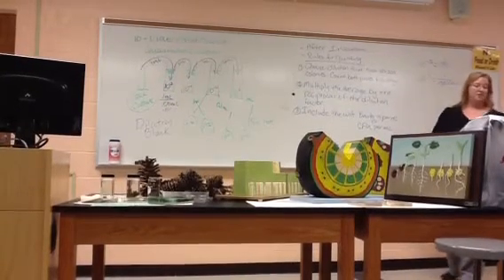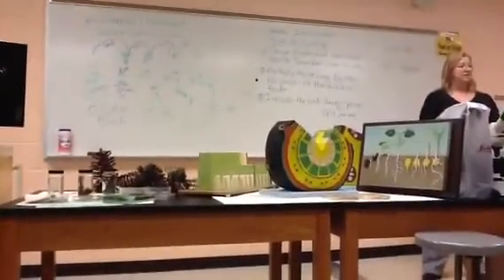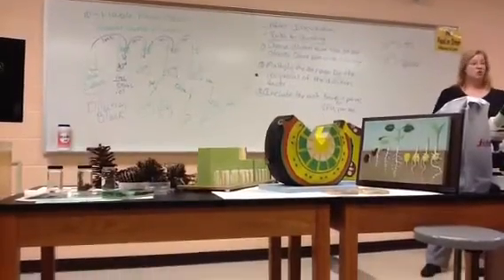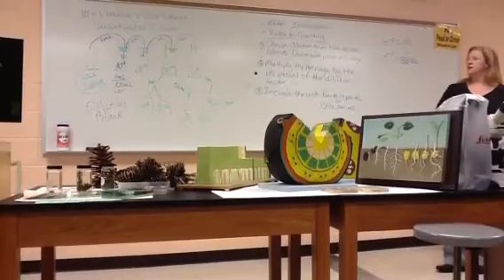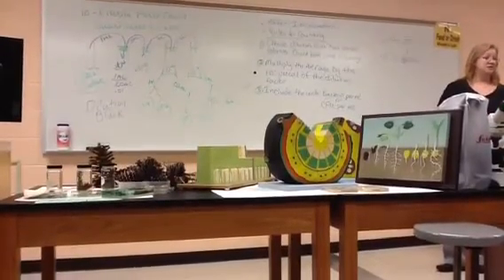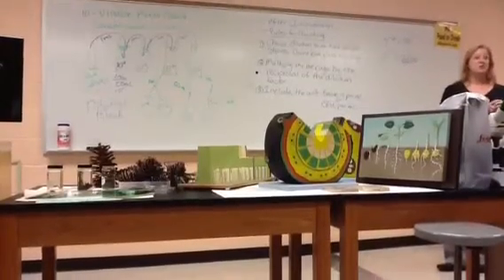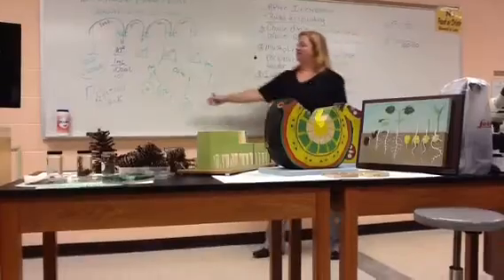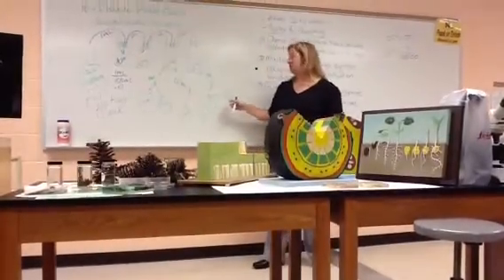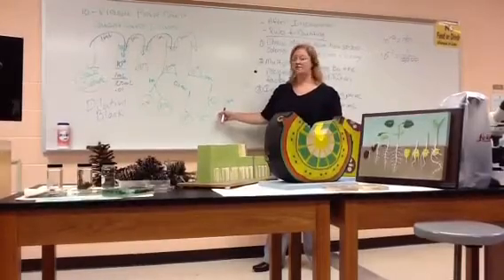So looking at your lab 9 plates in front of you, which plate do you think has between 30 and 300 on it? Second. The second one, right? So you look for a plate that looks like your second one. You don't want to pick one that looks like it has 31 colonies on it, because it's easier to count 31 than 300. You want to shoot for one that's somewhere in the middle. So you're choosing, looking at your 10 to the minus 6, minus 7, or minus 8 plate, which one looks like it has between 30 and 300 colonies on it.